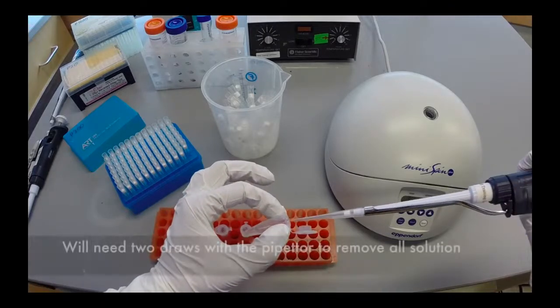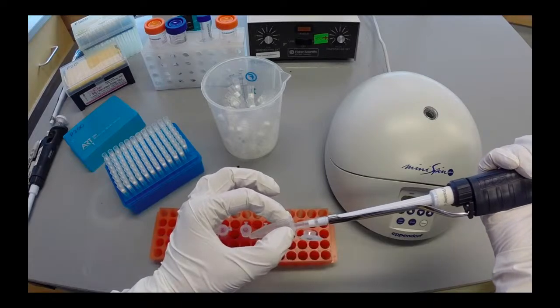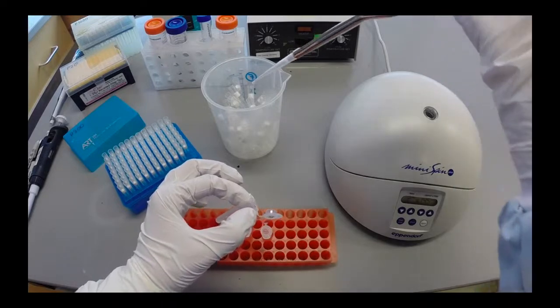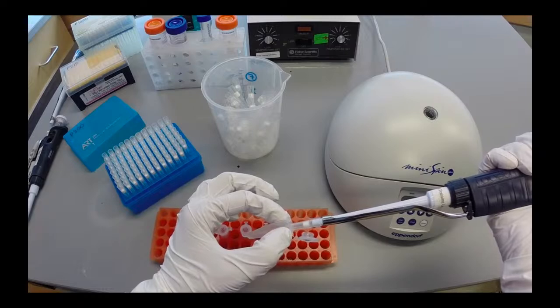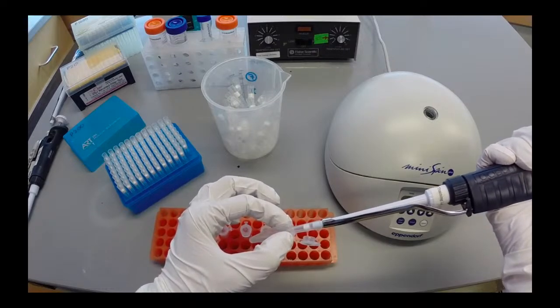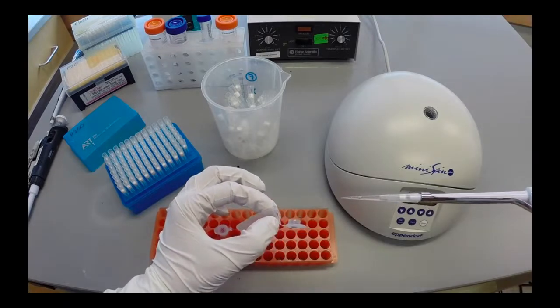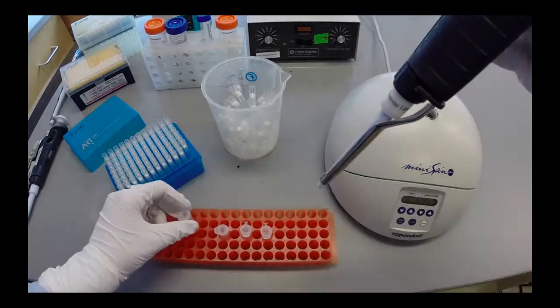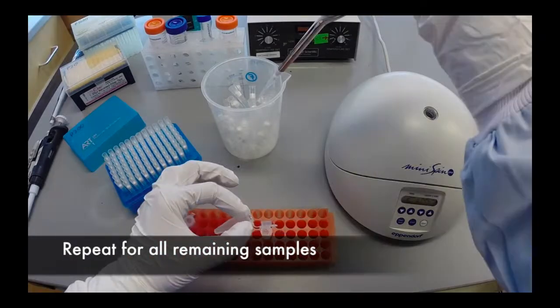On the first draw, you can expel the solution into the discard bucket and use the same tip to draw up again, as long as the tip has not touched other surfaces. Repeat this process for the remaining samples.